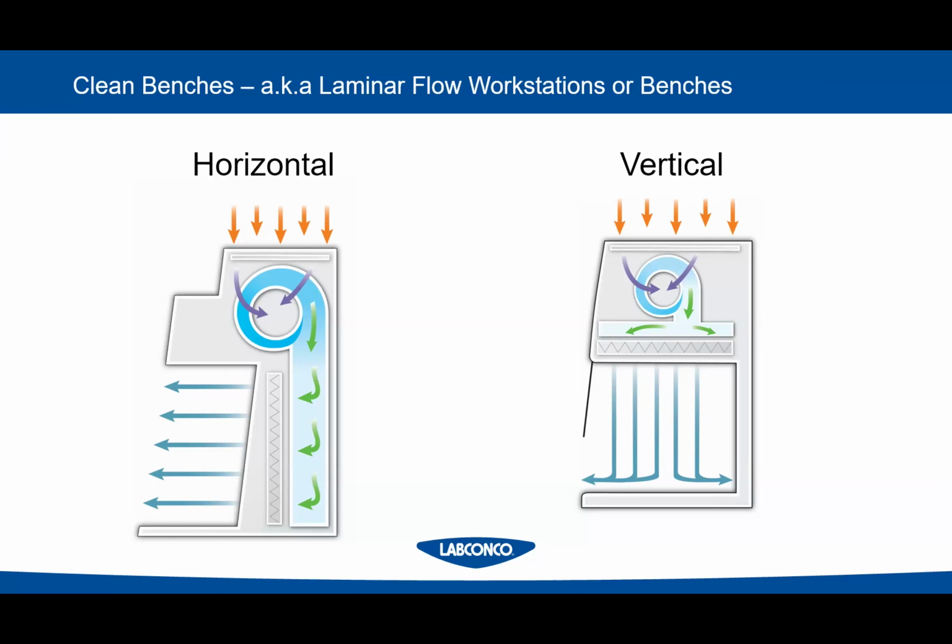This is great. I can walk up there. I can work. You find these in pharmacies. I don't know, is there a vet pharmacy on campus? Compounding vet pharmacy? If there is, they will use these to compound non-hazardous medications. Sometimes you can use a vertical as well. They typically like the horizontal.